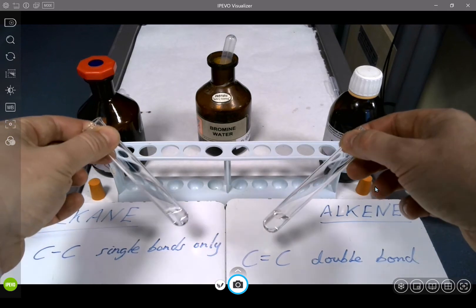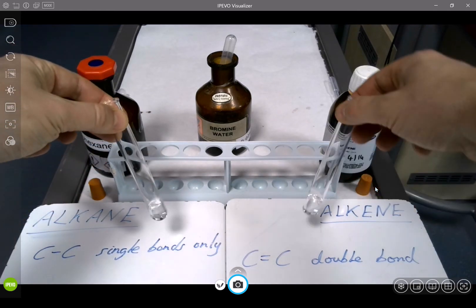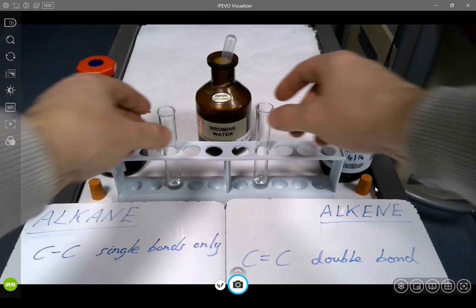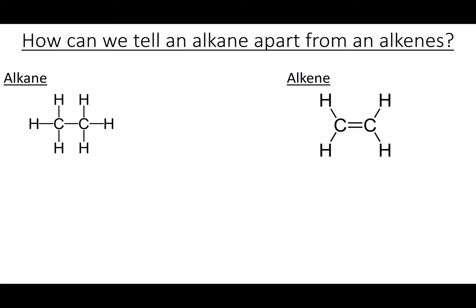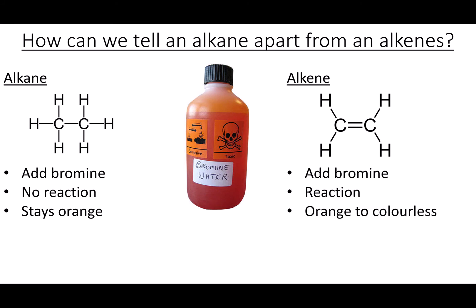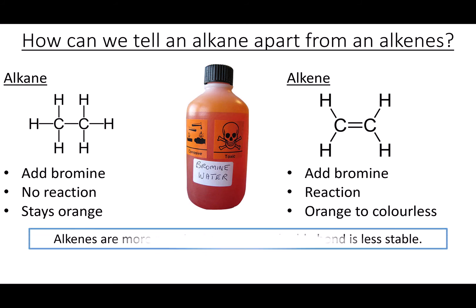Here we have the two samples. We've got alkane on this side and alkene on the right. They look exactly the same. So here's how we test for the two. Firstly we add some bromine water, which is orange. With the alkane there's no reaction, so the solution stays orange. And with an alkene there is a reaction, and we see a colour change from orange to colourless. This happens because of the double bond, which is reactive — it's not as stable.